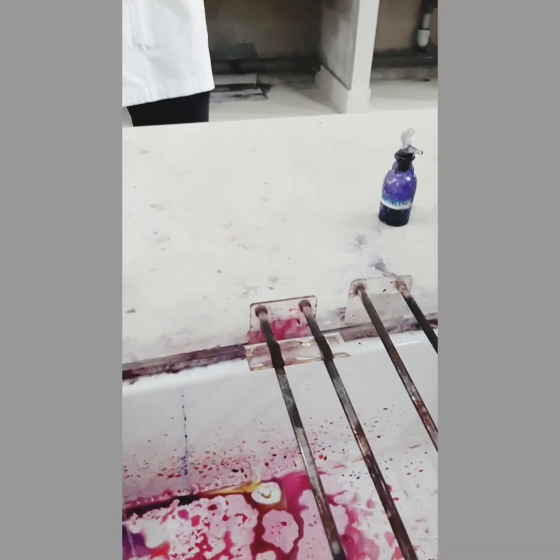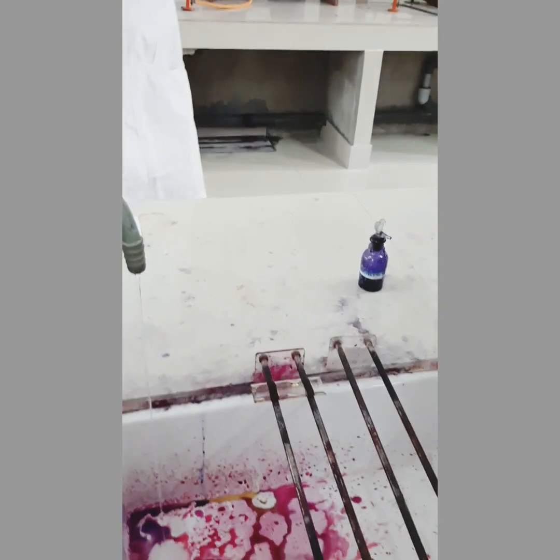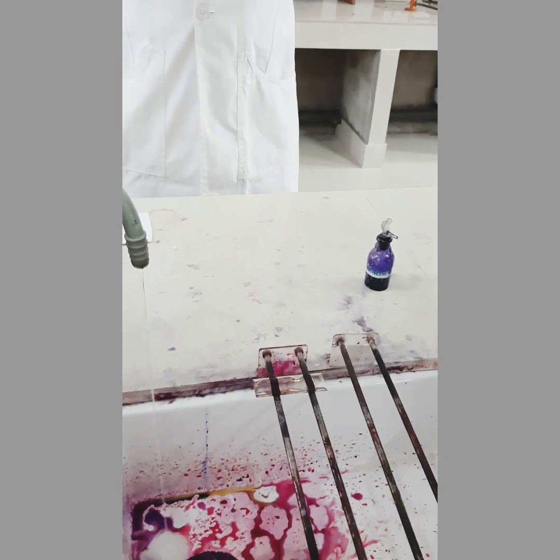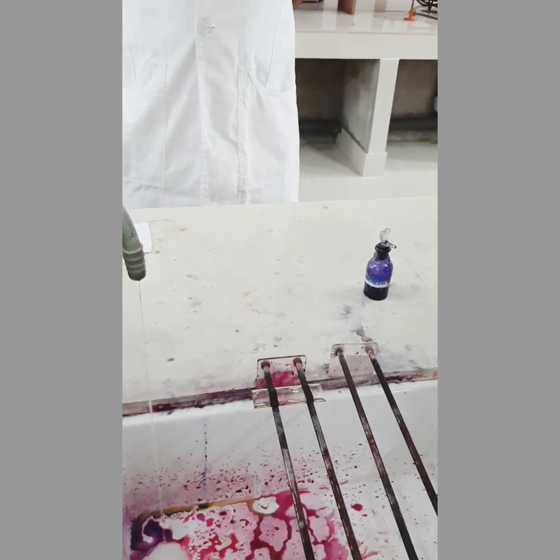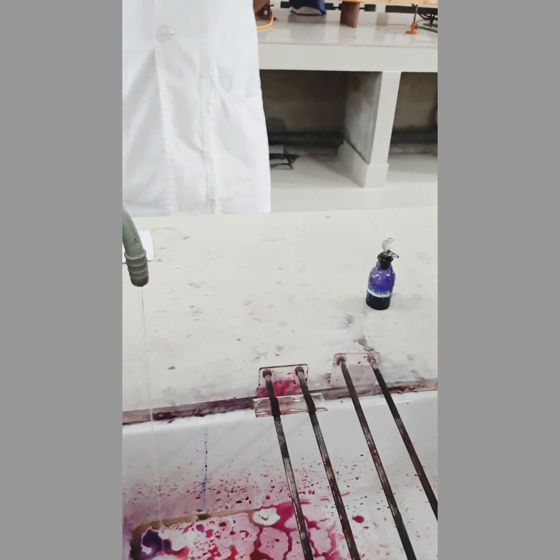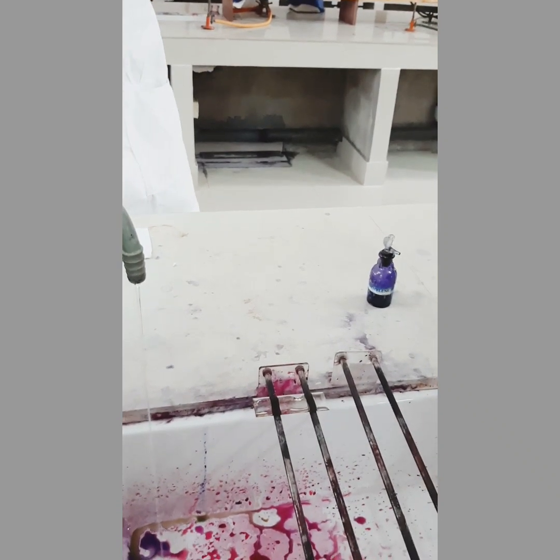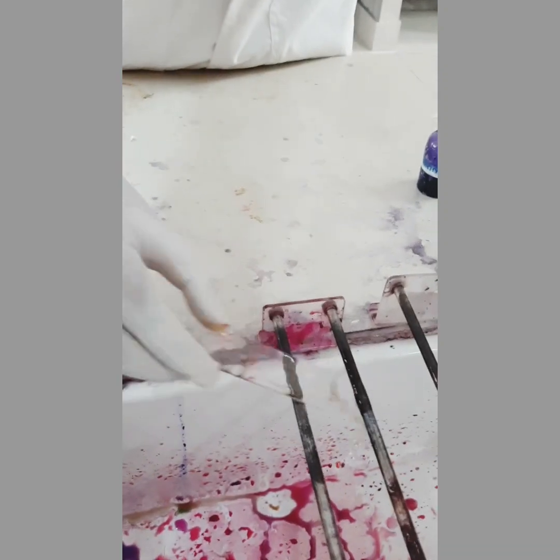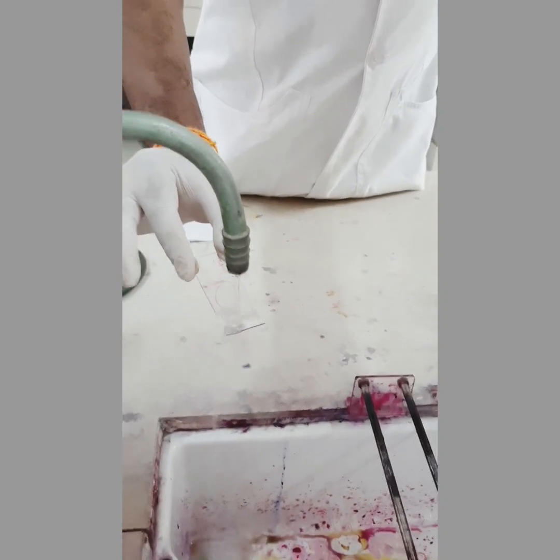So first step, pour carbolfuchsin over the smear. Keep it for 5 minutes with intermittent heating without letting the stain boil or dry. Then wash it with water. Decolorize with 20% H2SO4 and keep it for 3 minutes. After primary staining, you can see a pink color on the slide, because carbolfuchsin has a pink color, so the smear should be pink.